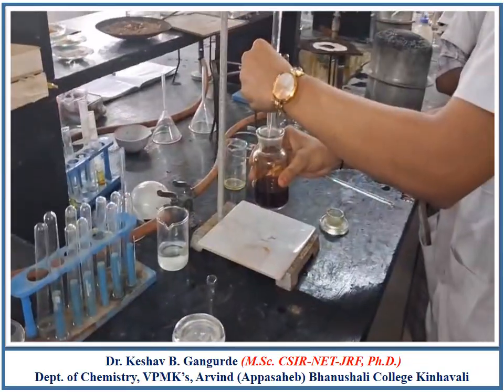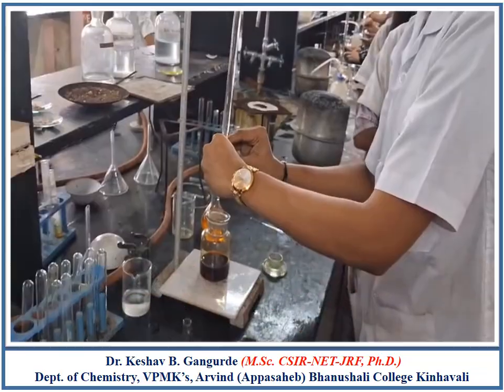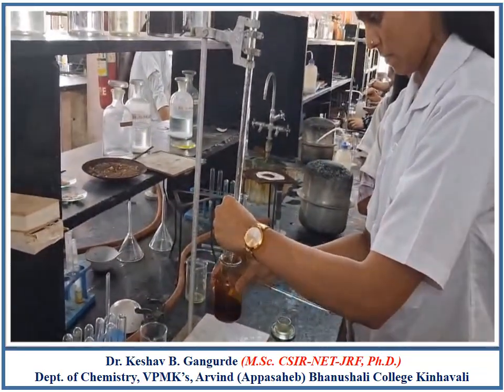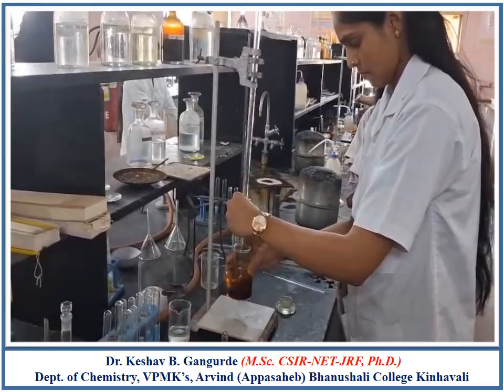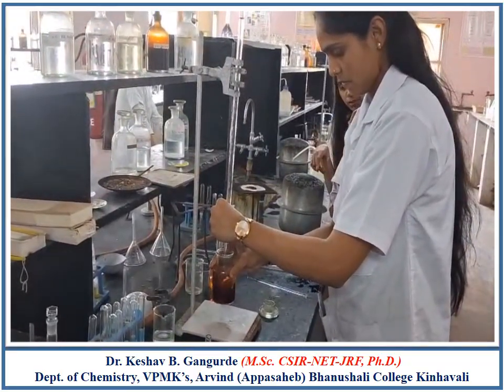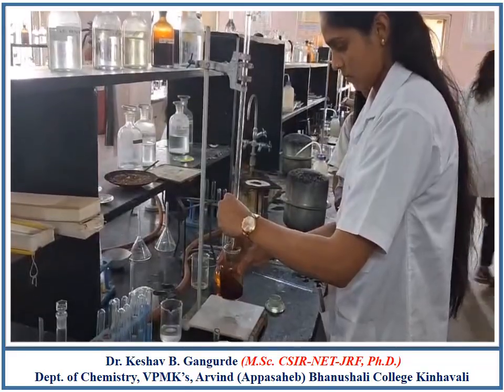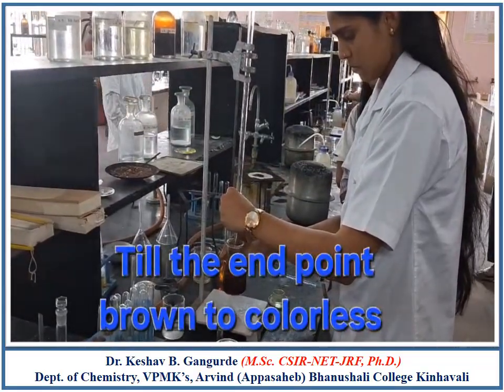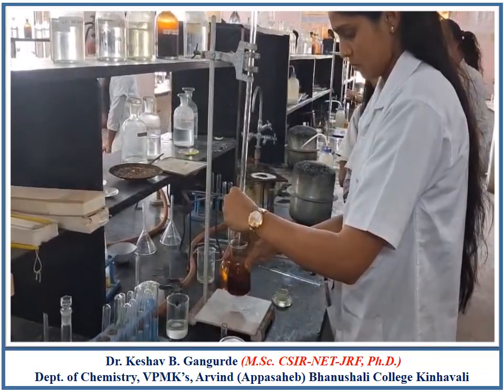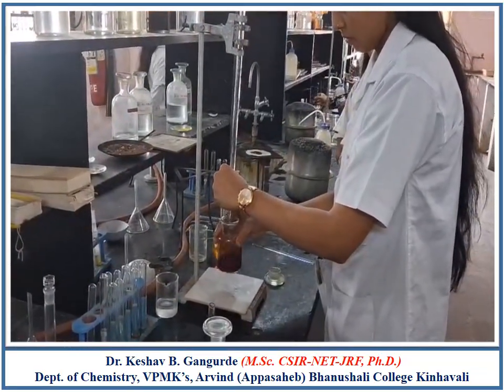Shake the bottle and then titrate the liberated iodine against burette solution, that is standardized 0.1 normal sodium thiosulphate solution, till the end point brown to blue, blue to colorless. That is, the final end point is brown to colorless.